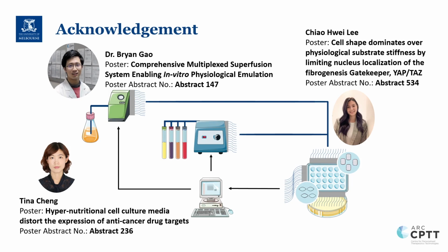Thank you for the presentation. I was wondering, apart from the images to determine biocompatibility, have you carried out some other type of analysis, like ion presence in the medium and so on?